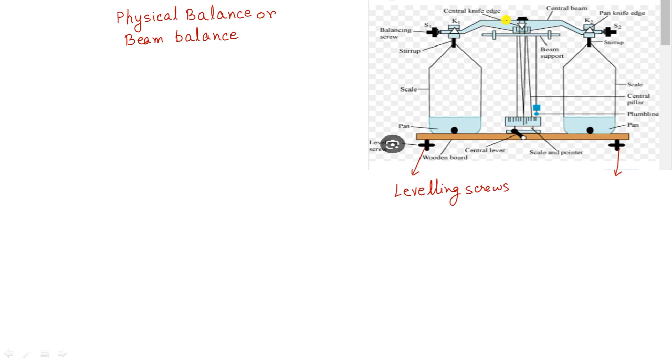Here you see the central knife edge, which is a prism. We can call it the fulcrum of the physical balance. It will move in this direction or that direction. This is the central beam of the physical balance.